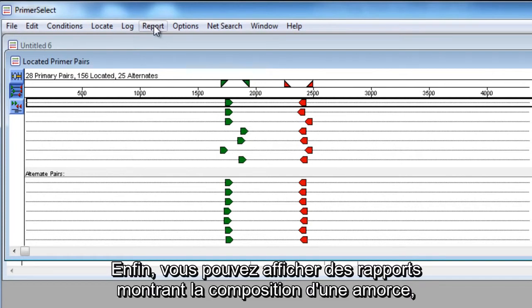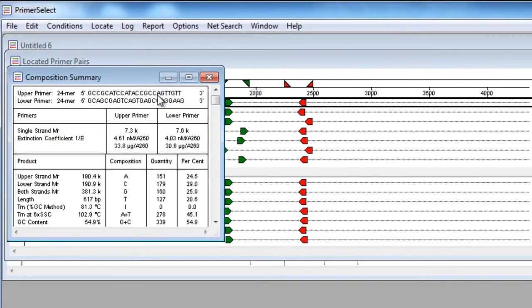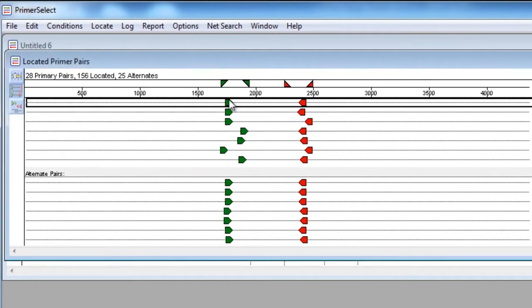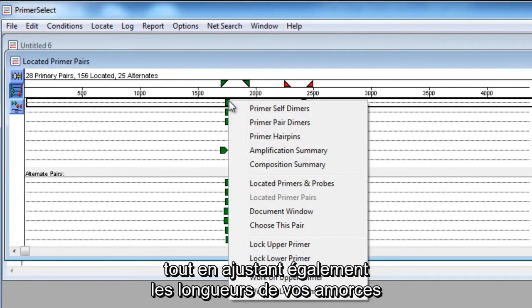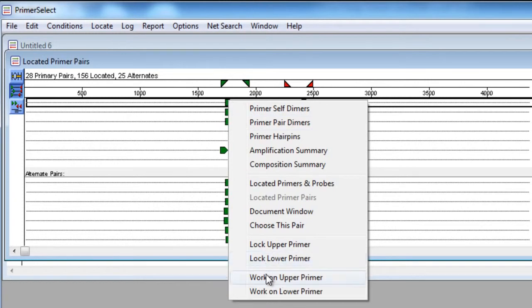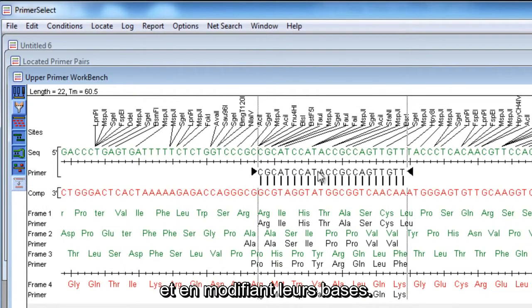Finally, you can view reports showing primer composition, while also adjusting the lengths of your primers and modifying primer bases.